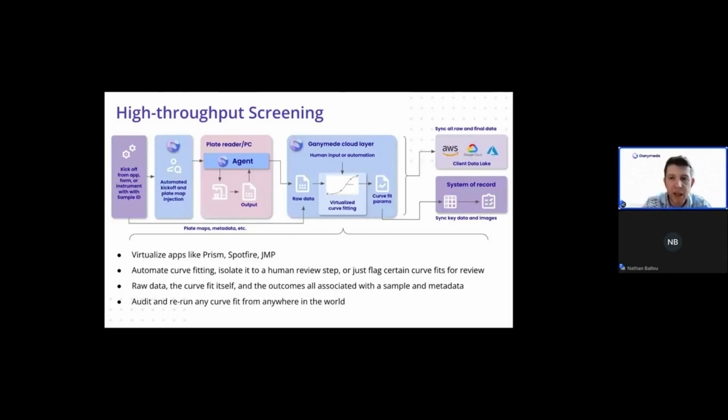itself. That then allows all of this analysis to be traced from the raw data to the analysis outputs and know what was done there and know what sample ID is associated with everything, so that the full end-to-end can be associated without humans having to go manually tag their data or put things like sample IDs or batch IDs into their file names, which is in 2023 not something that people should have to do anymore.